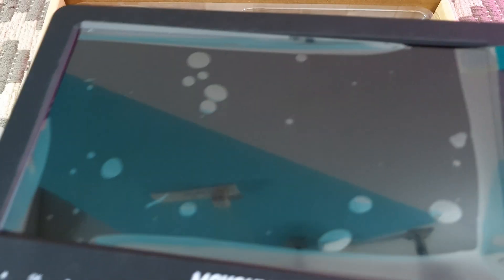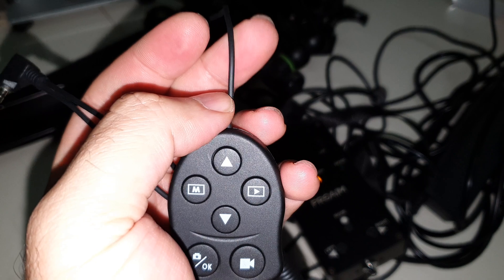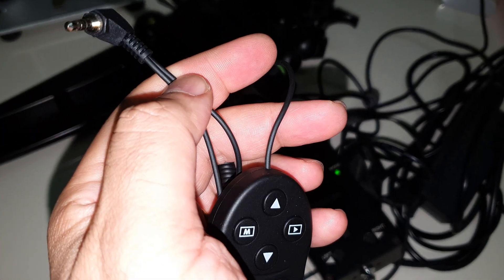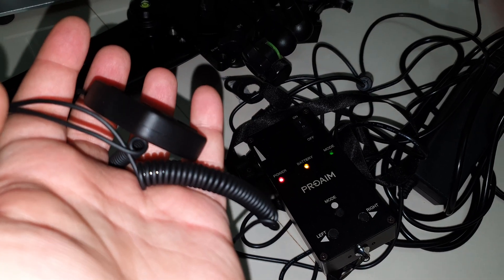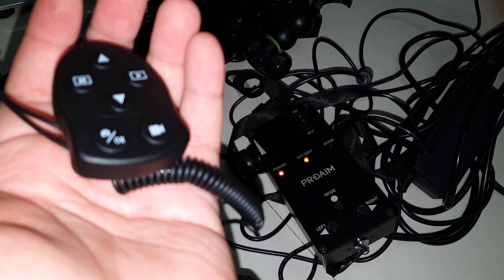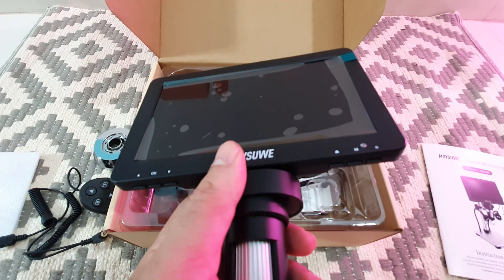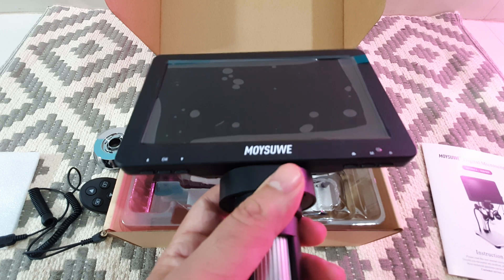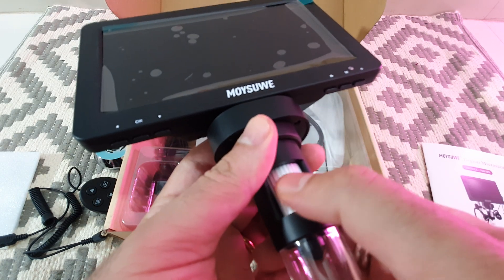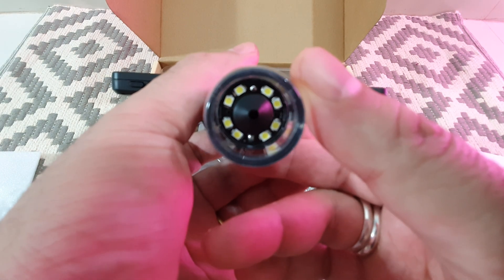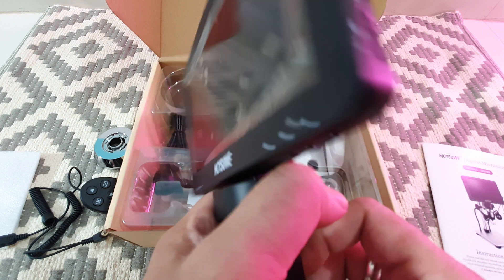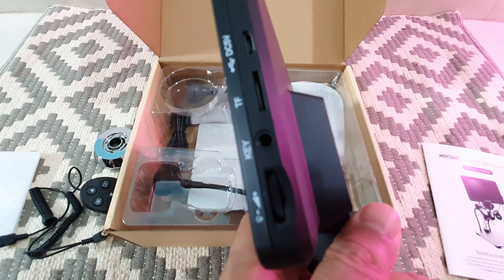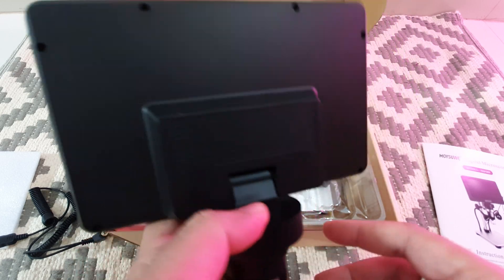Let's get a hold of the screen. So it has a screen guard on it. Before I go to that, this controller unit is very flimsy, so if you have small kids around and they actually pull it really hard it's going to knock off the wiring, so you have to be really careful with this. This looks like one of those microscopes which you get in the market which has this adjustable ring. This one is very similar, just that it's got an integration of a screen which makes it much easier to have an output. It looks like it's got a tilt option as well, and the build quality is pretty nice.